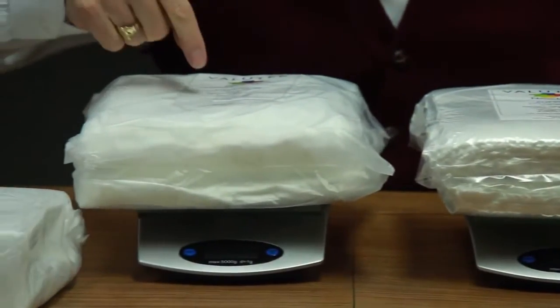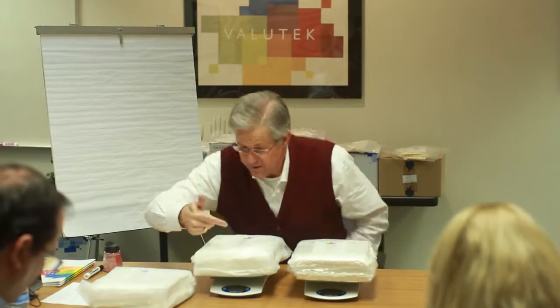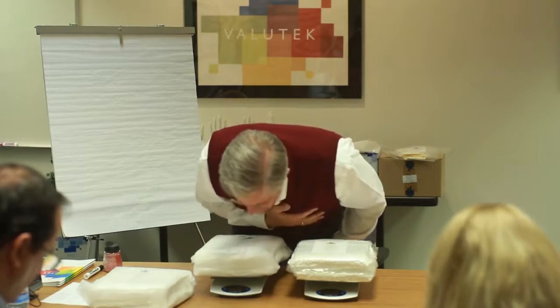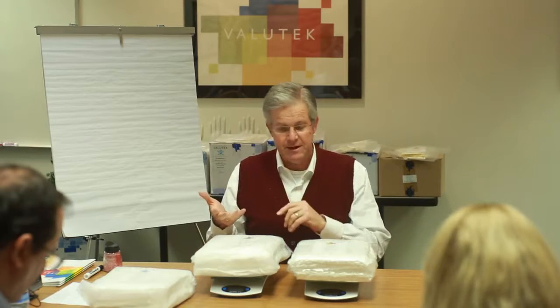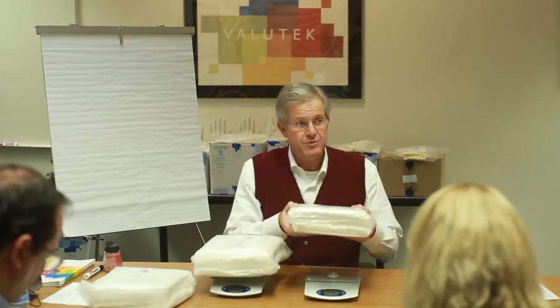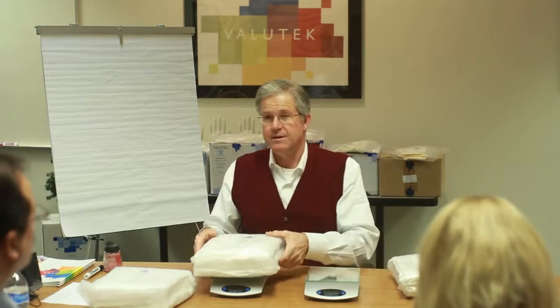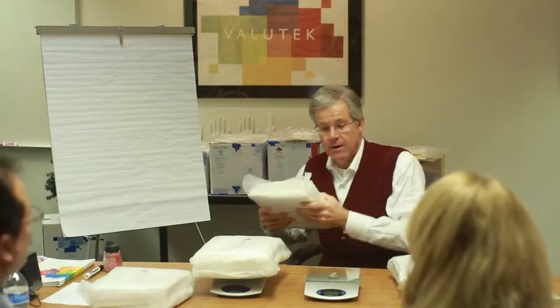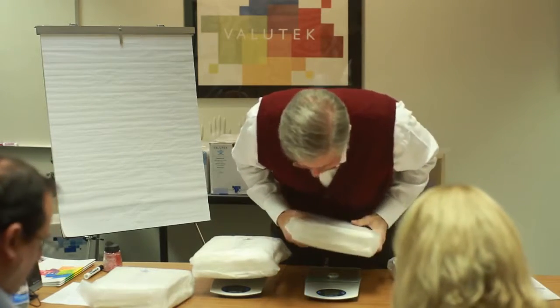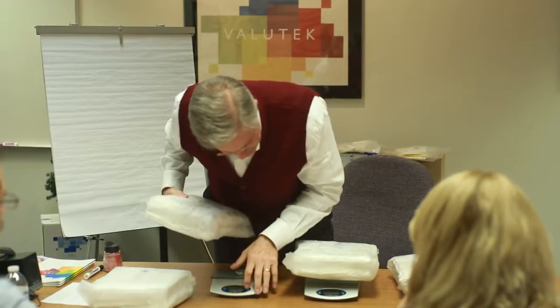This wiper here is two bags of 75, so this is 150 wipers. 150 wipers of this style wiper is only 1,077 grams. What we basically just illustrated here is that the first wiper on a per-each basis is over 50% denser and heavier than this wiper.